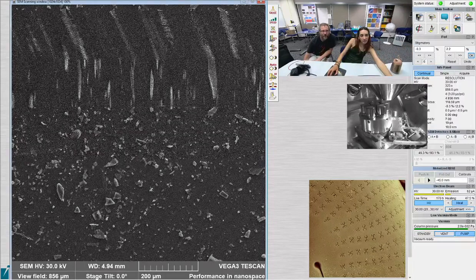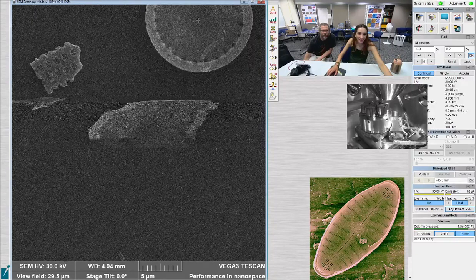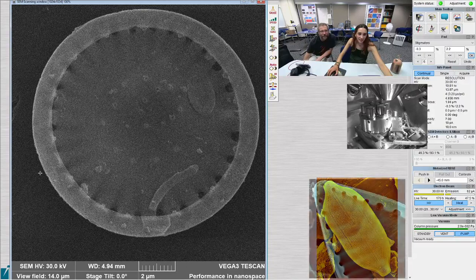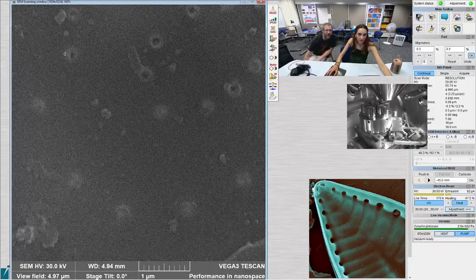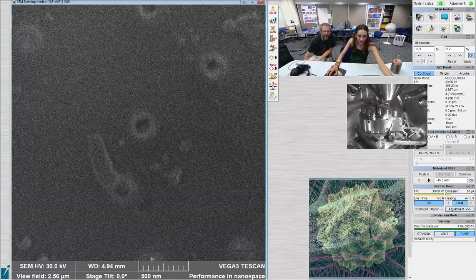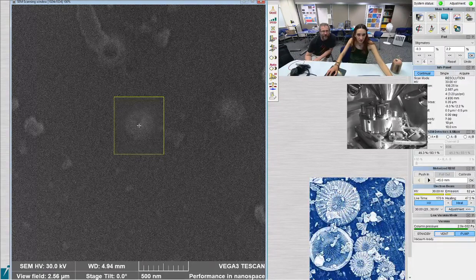There's a round one. I think it's the same one. Look at the Oligocyra next to it. This one? Yeah. You can see the... can you zoom in on those pores? The one right in the middle there. Just below that actually. It's at 6 o'clock. This one? Straight down. Right there. Actually, the one that you had in the middle might also be good. But see if we can get that into focus. I think around here. As good as it can get.